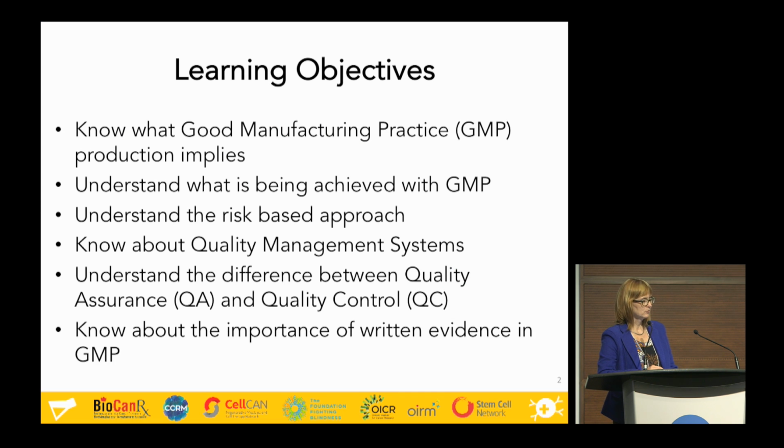So I'm going to talk mostly about quality management systems and good manufacturing practice, the goals and methods of these two systems, and I will give two examples, which are reagent management and documentation.